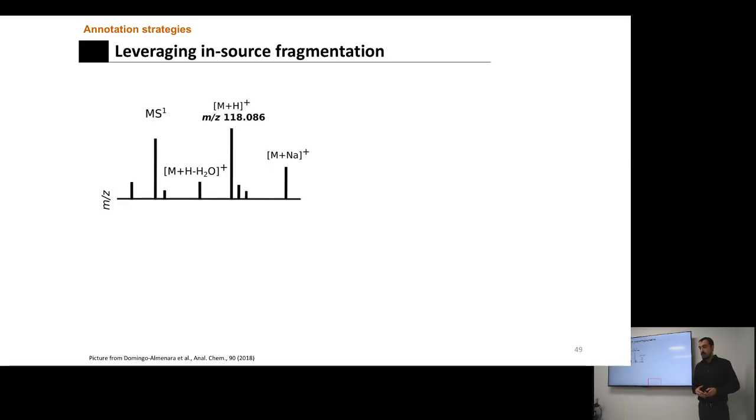And then, okay, we said, okay, we have METLIN. We have the largest collision-induced dissociation tandem mass spectral database. For all the molecules that we have in the database, we have data at 0, 10, 20, and 40 volts. That means that we have low collision energy spectra in our database. And we know that those in-source fragments that we observe in typical MS1 experiments are the same fragments that we observe in low energy MS/MS data.